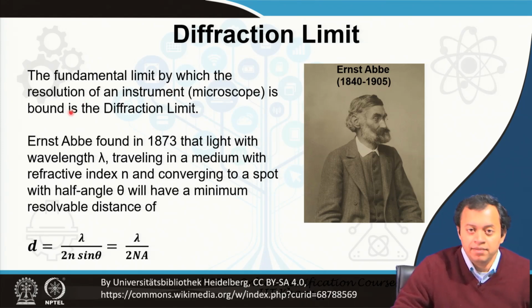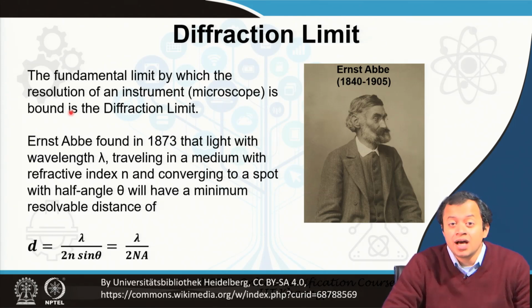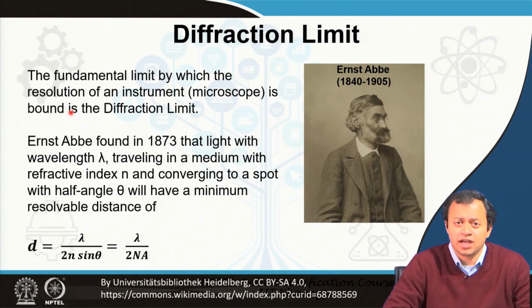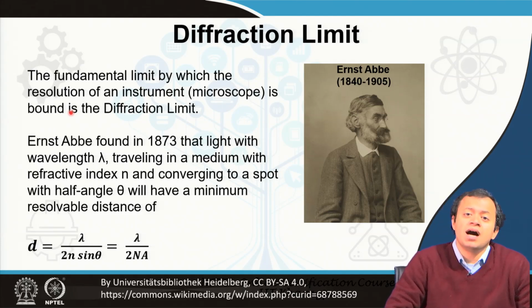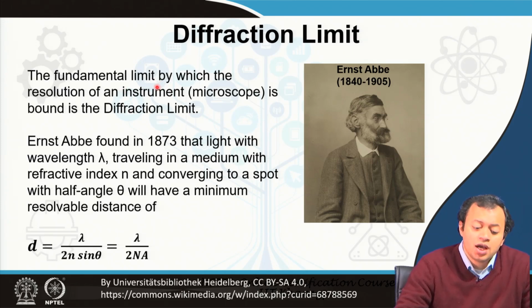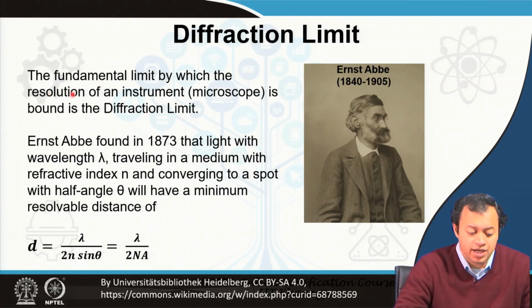I am not talking about aberration, errors in making lenses, or manufacturing defects. There is a fundamental limit which bounds the resolution of an instrument.